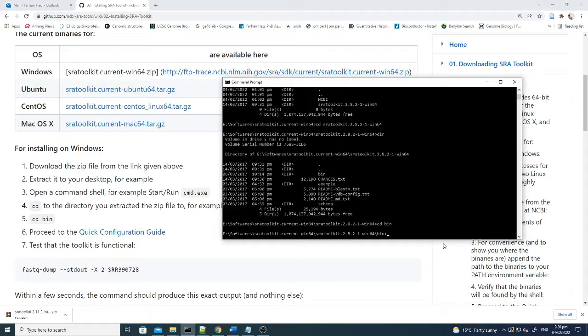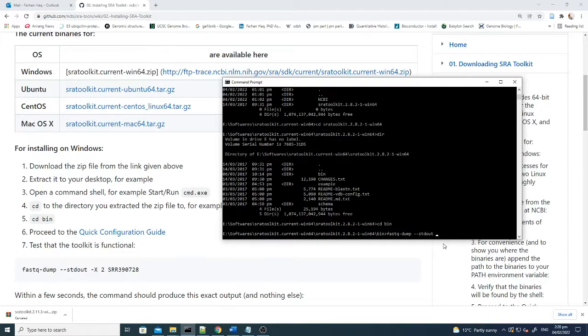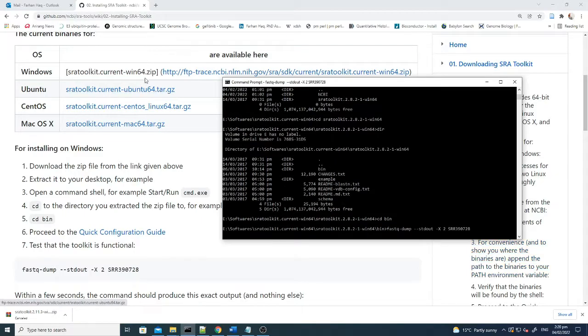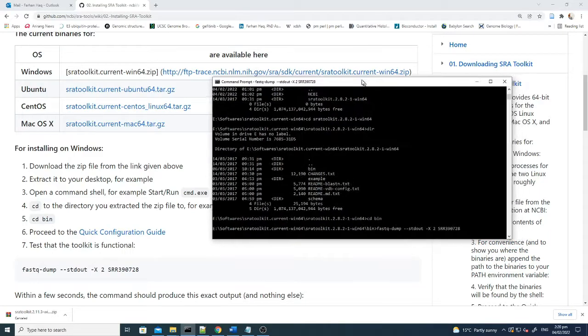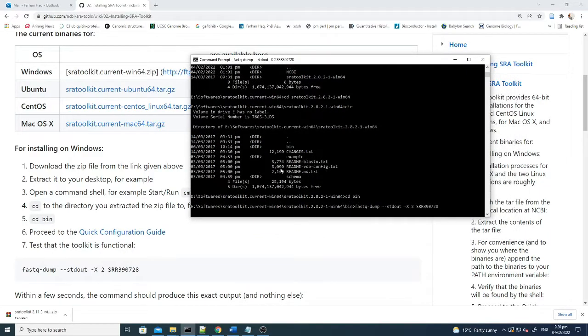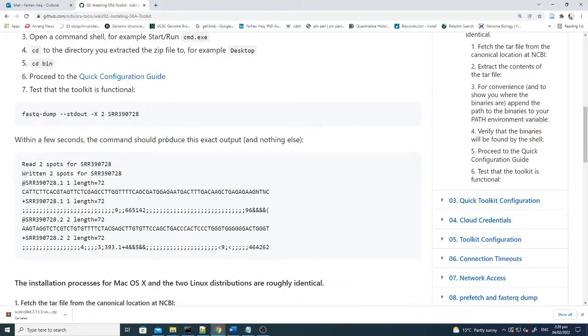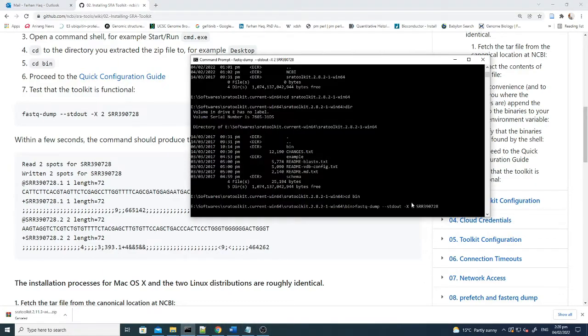After going here, you can just paste this fastq-dump command to check whether your SRA toolkit is working properly or not. If you write it here and try this, within a few seconds the command should produce the exact output shown in the documentation.